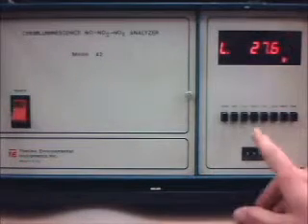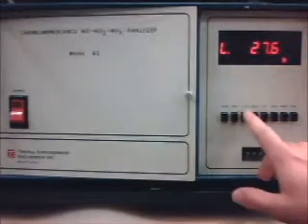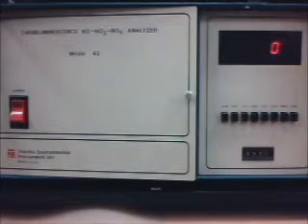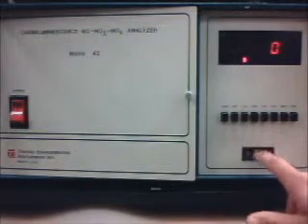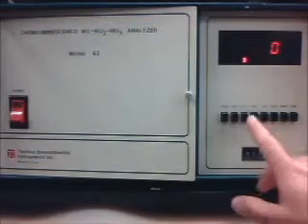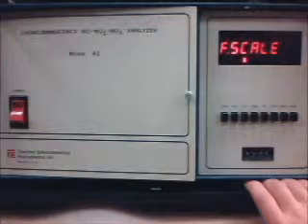The next push button is 0/FS. It stands for 0 and full scale, so when you press it, it allows for a 0 reading. So what you do is you send through 0 air through the 0 air line, and you wait, let's say 3 to 5 minutes, and then you set this down here to 0. You hit enter, and that should be your 0 reading. If you hit it again, this is the full scale reading. I don't know if the full scale reading is reading NO or NO2. I'm assuming it's reading NO, but I'm not entirely sure.